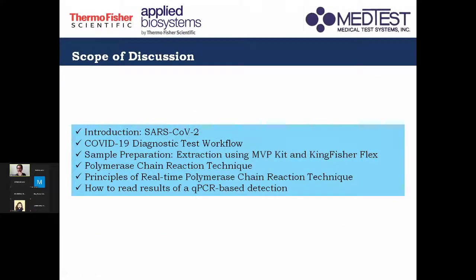Okay. So basically ang discussion po natin ngayon is more on the principles, the concepts that underlie all the instruments that you are going to use to detect SARS-CoV-2.